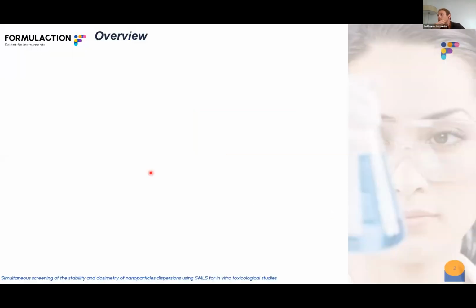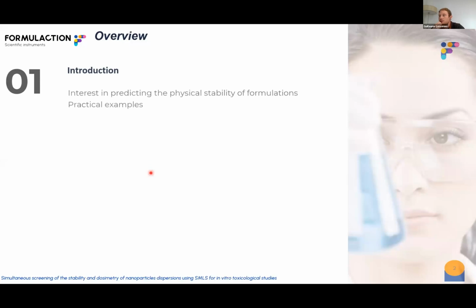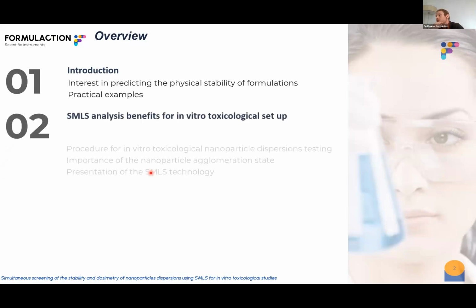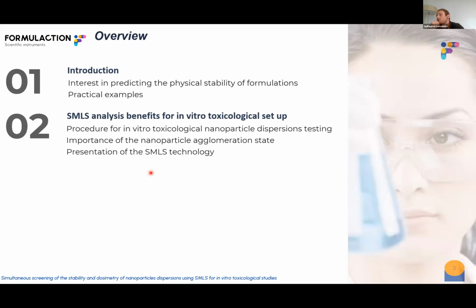First of all, I will make a quick overview of the subject. I will make a quick introduction on the interest in predicting this stability for formulation with some practical examples, before moving to the static multiple light scattering analysis benefits for in vitro toxicological setup, with the explanation around the procedure, the importance also to evaluate the nanoparticle agglomeration state, and also the presentation of the technology.